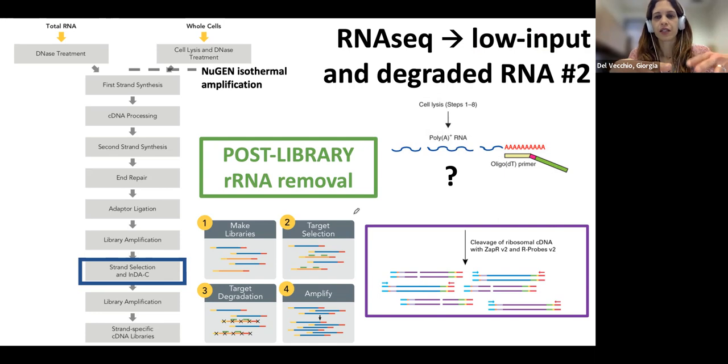The difference between a regular amount of RNA and low input RNA is that, again, we cannot use the RNase-H approach from before, especially the ribo-zero, which still involves beads, so it doesn't work with low inputs.